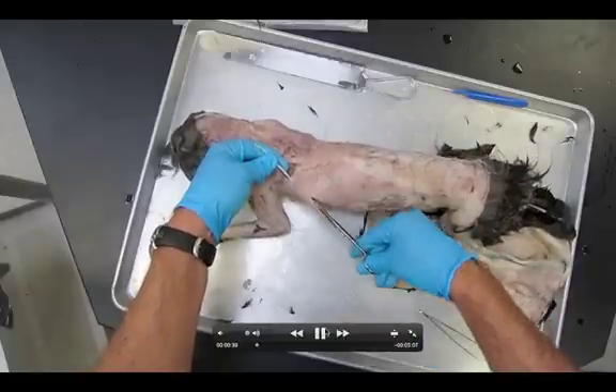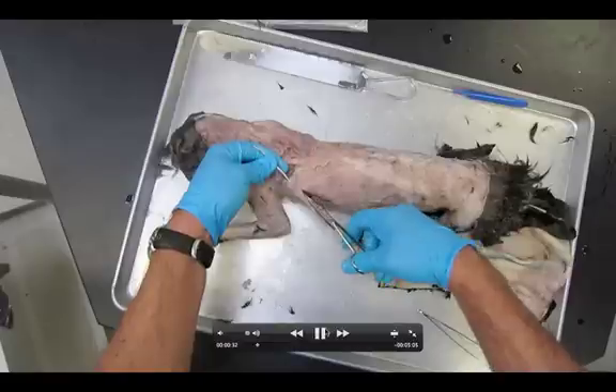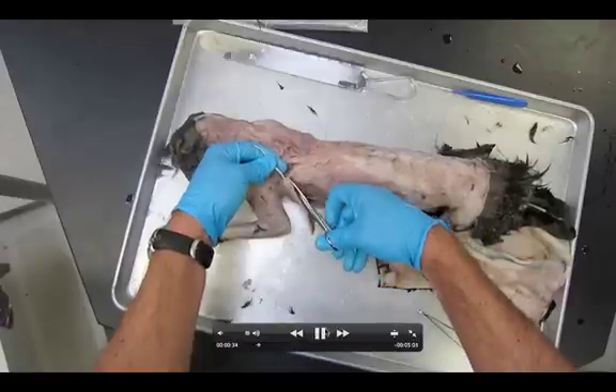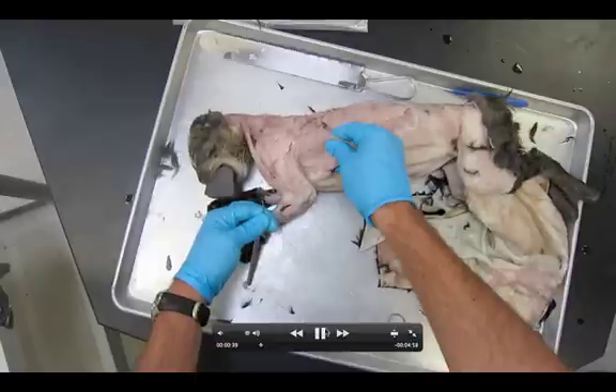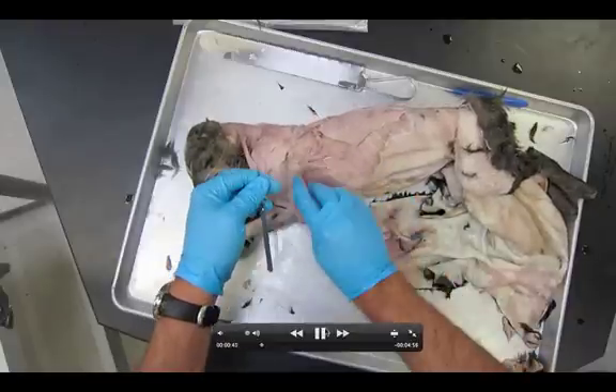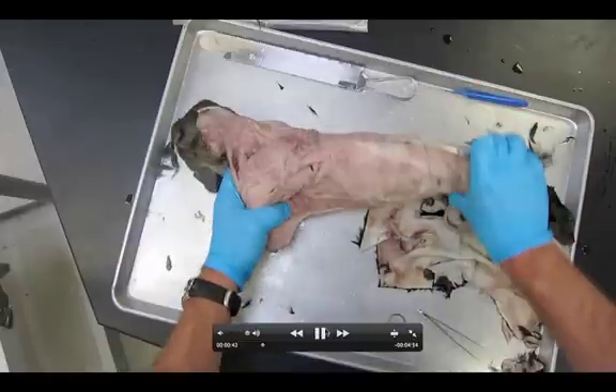Using the probe as a guide, we're going to cut the latissimus dorsi into two pieces right in the middle. Now I can flip it up and flip it down, and we should start seeing some of the muscles of the rib.